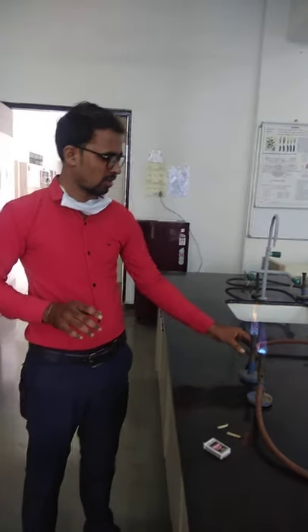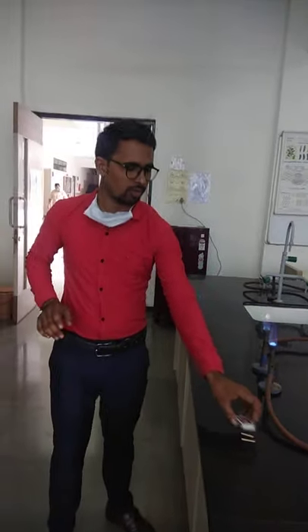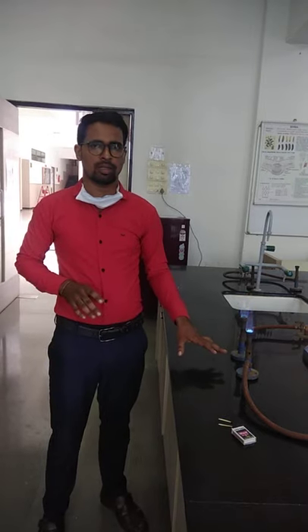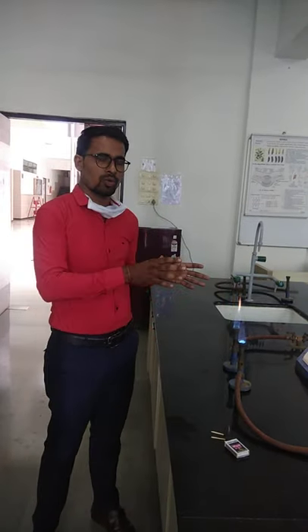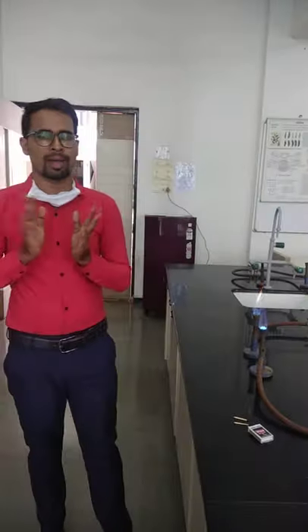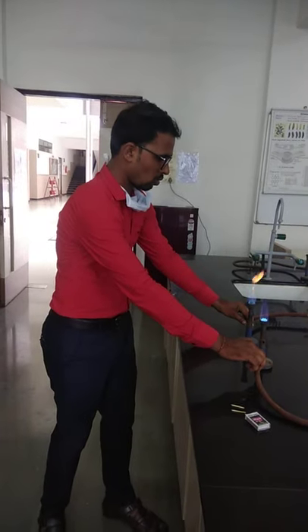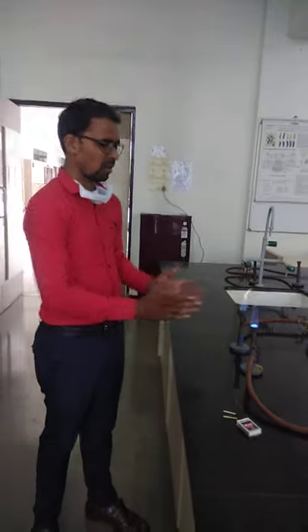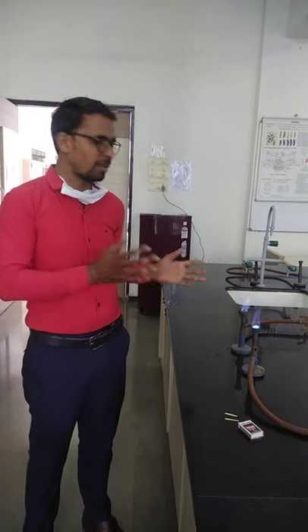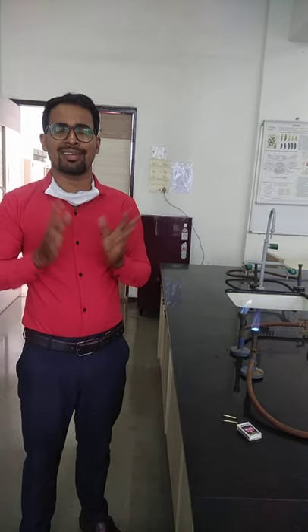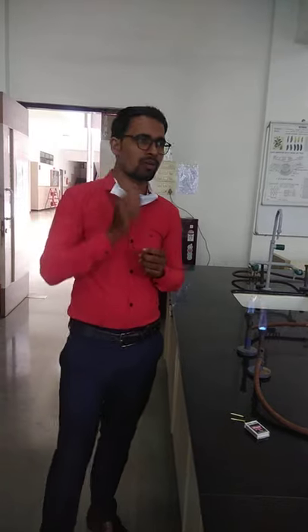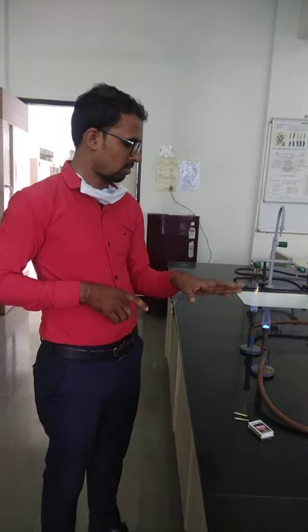Next is the Bunsen burner. You can see the Bunsen burner which is available in our laboratory. This burner is useful for creating an aseptic environment for the transferring of microbes. You have to keep two burners with projecting flames, and in between the two flames you perform the aseptic transfer of the microorganism. We also sterilize our nichrome wire by using these particular burners.